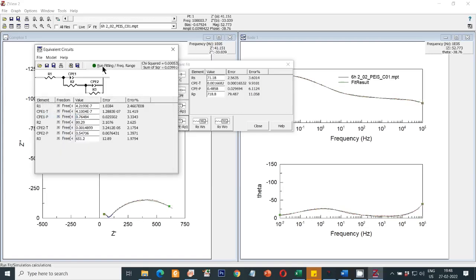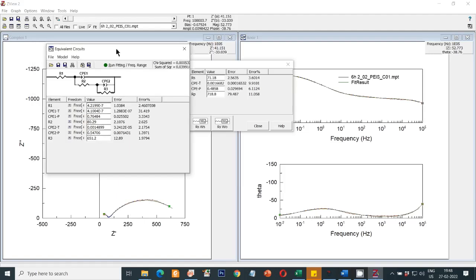Now you can see the fitting is perfect for both the Nyquist and Bode plots.